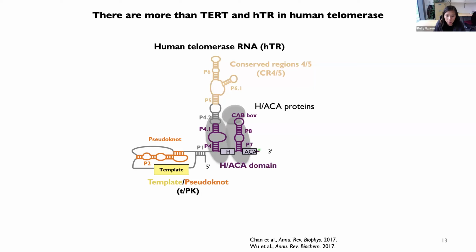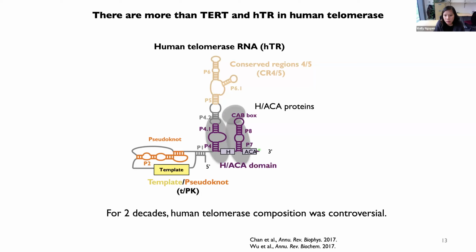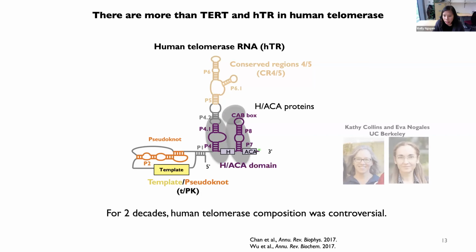But this composition of telomerase has, for many years, for 2 decades, been controversial in the field. So the question of what's in human telomerase has been a matter of debate for many years, and there are many different proposals of what's actually in the enzyme. And in order to address this, I was very fortunate to be offered a postdoc position with Kathy Collins, who is a telomerase expert, and Eva Nogales, who is a cryo-EM expert, to use cryo-EM to address this problem by visualizing telomerase itself.